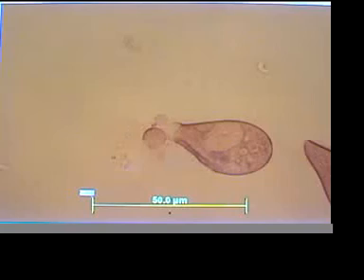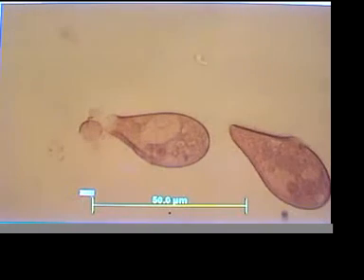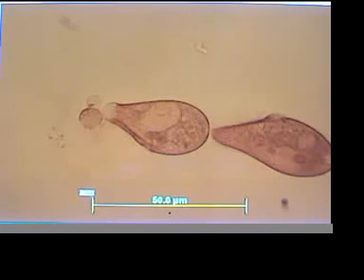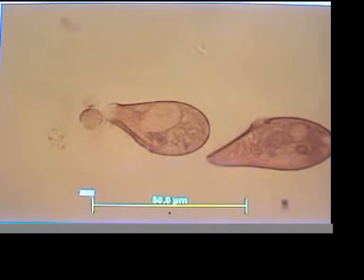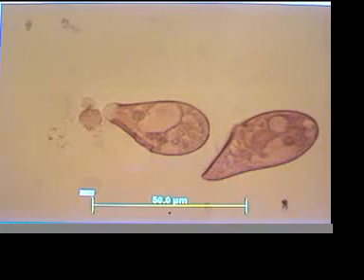Okay, we have somebody here. Looks like we might have 2 friends participating in the experiment. Let's see what we can get there. Okay, we can focus.